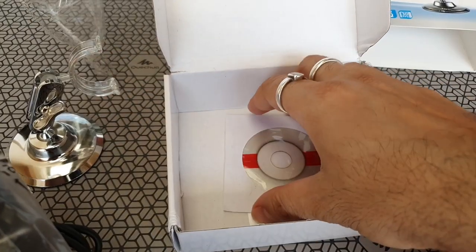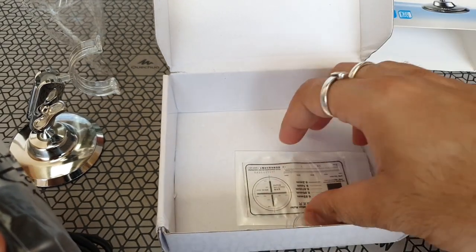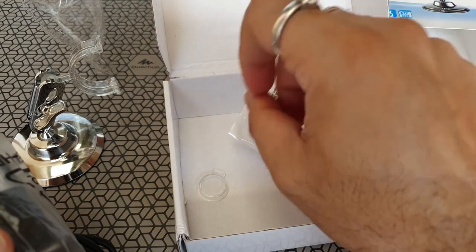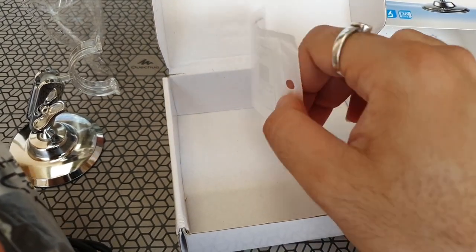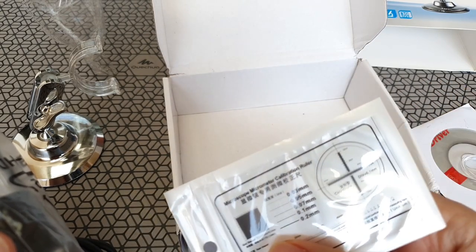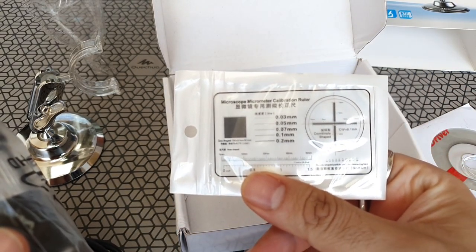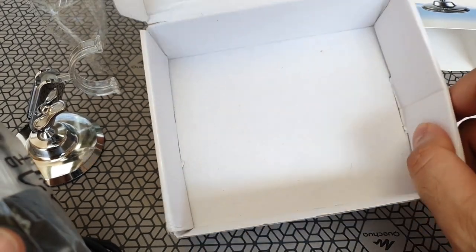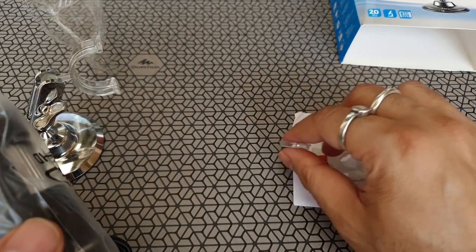There's a driver CD — obviously there's a lot of images and data going to and fro so it includes a CD. There's also a cover of some sort and a calibration sticker or scale, maybe just to help you understand how the device works. We have four items already, plus the microscope itself.